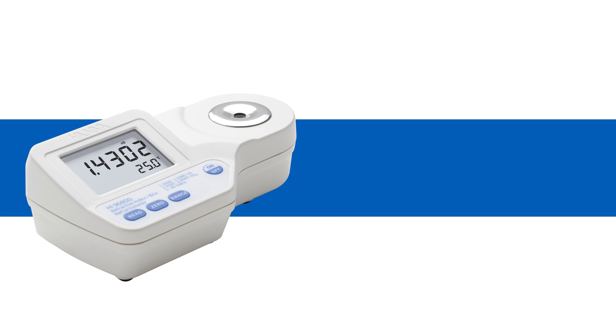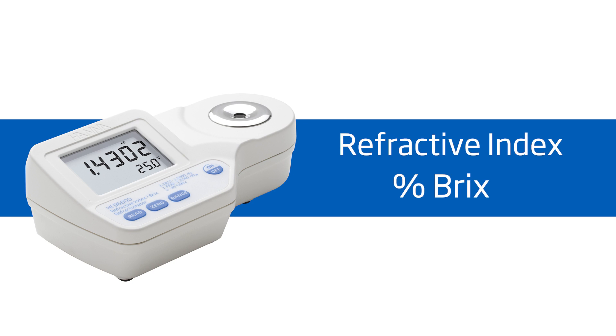This meter is ideal for anyone using refractive index or Brix to ensure purity in products. It offers high performance and eliminates uncertainty involved with mechanical refractometers, all at around $300.